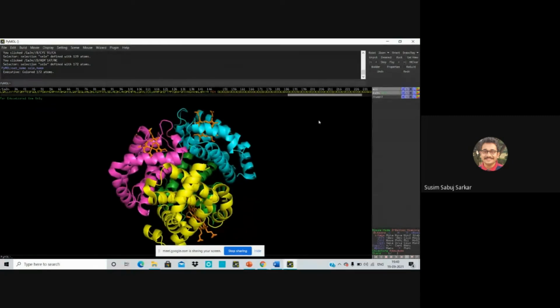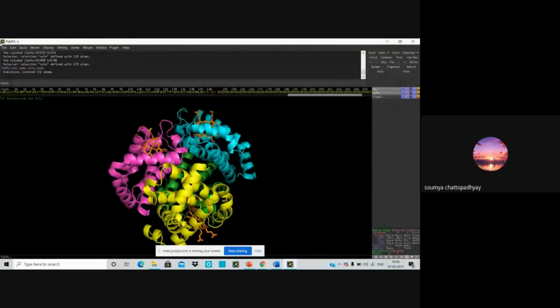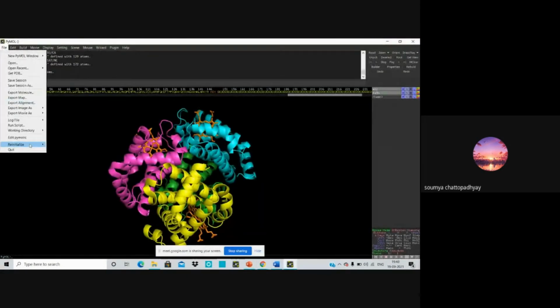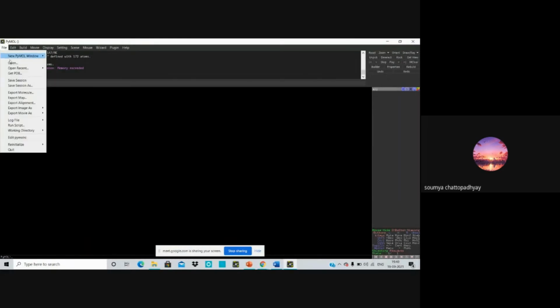Yeah, very nice. And if you want to know about the docking part, we can also dock molecules. Now, what is docking basically? As I said, I will use the ribonuclease. First, let me show you. These are the proteins where we had something in them, right? We had some ligands attached to them.